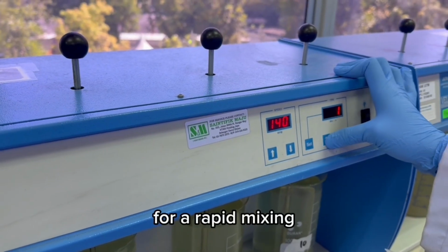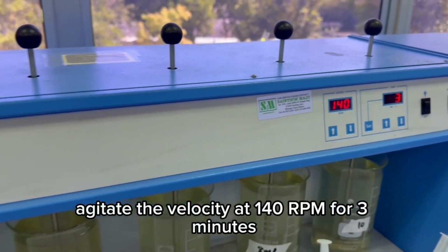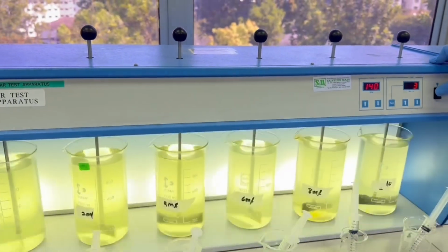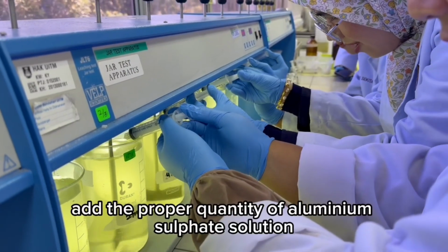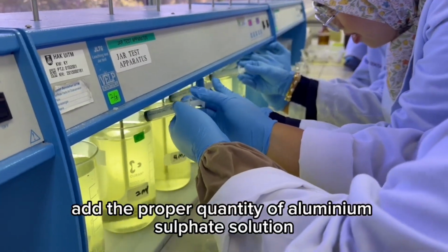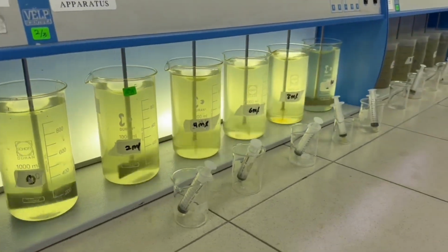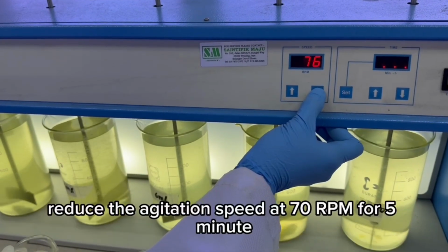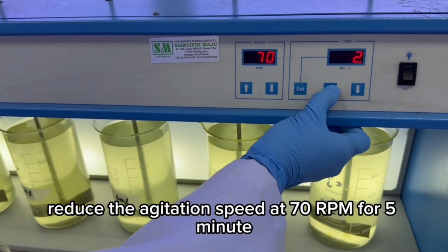For rapid mixing, agitate at a velocity of 140 rpm for 3 minutes. Add the proper quantity of aluminium sulfate solution. Reduce the agitation speed to 70 rpm for 5 minutes.